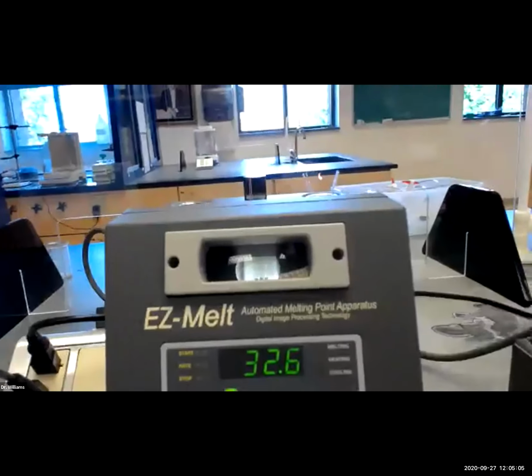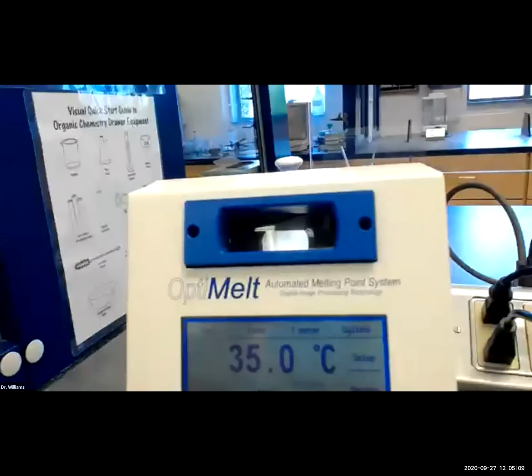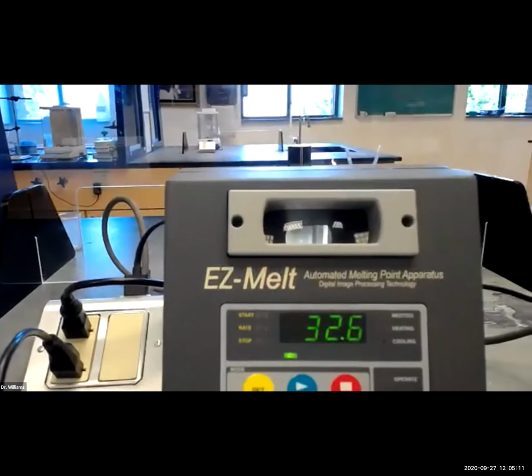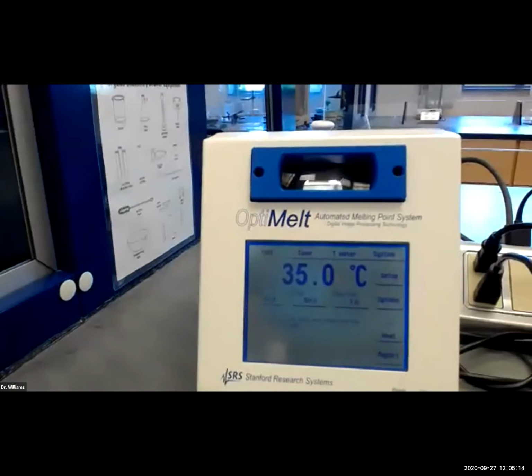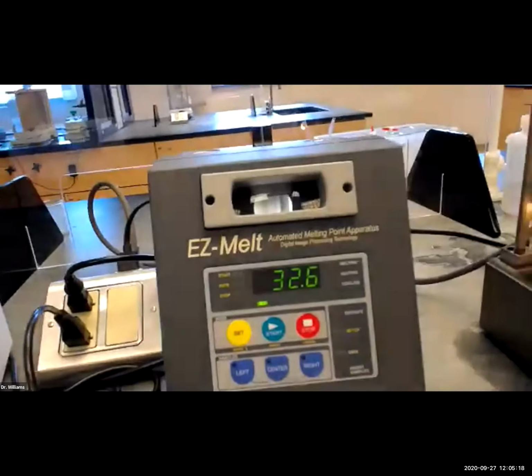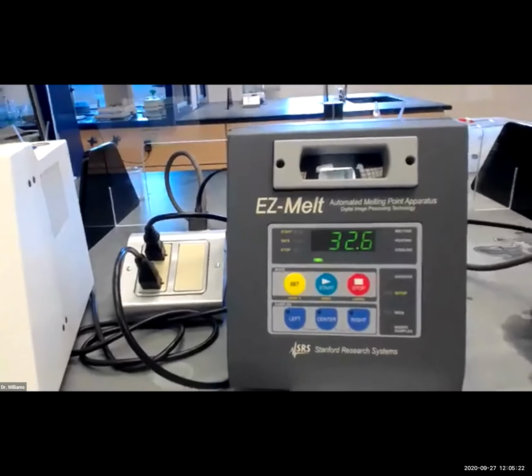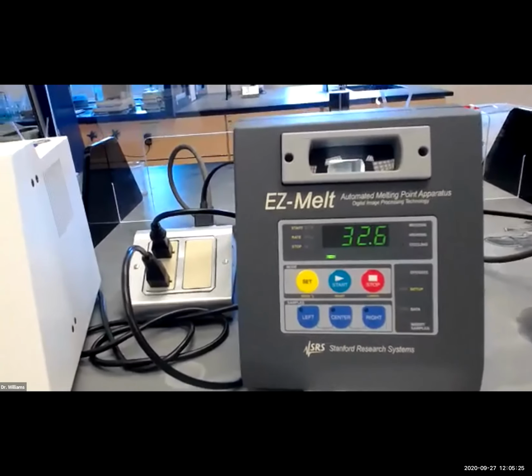All right, folks, so here are the two automated melting point instruments that we're going to use. One's called an Easy Melt, and the other one's an OptiMelt. The only difference is this is a touchscreen, and this you actually have to push the buttons. Okay, so those are the two. We only have two, and we have 8 students. So that means 4 students per instrument.